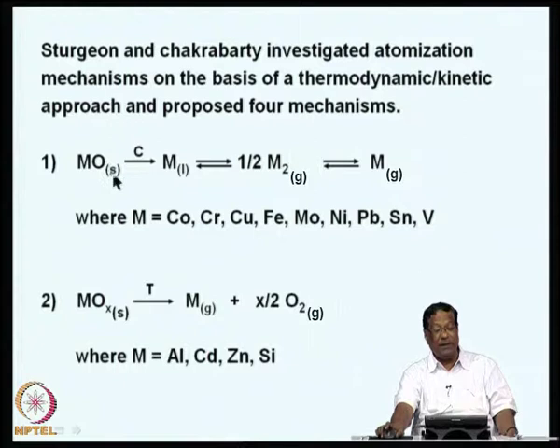So, how does this happen? Sturgeon and Chakravarti have investigated the atomization mechanisms on the basis of a thermodynamic and kinetic approach, and they have proposed 4 mechanisms.